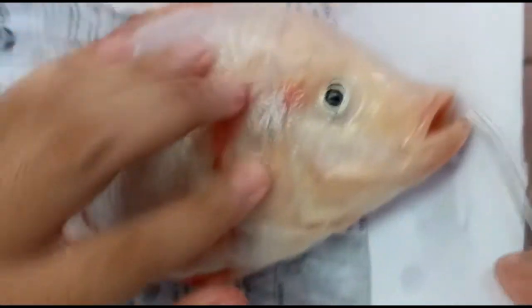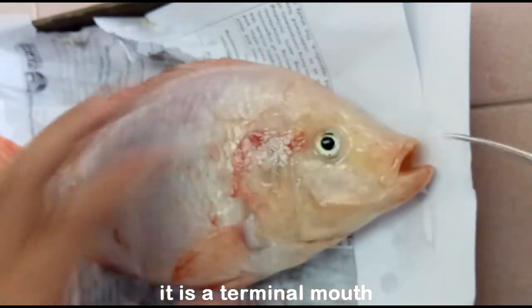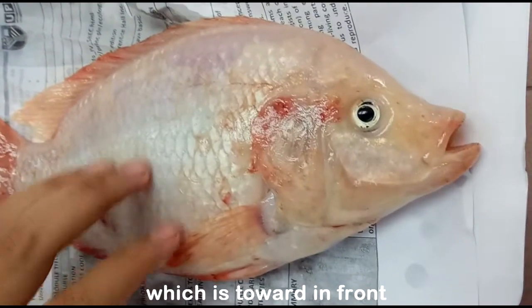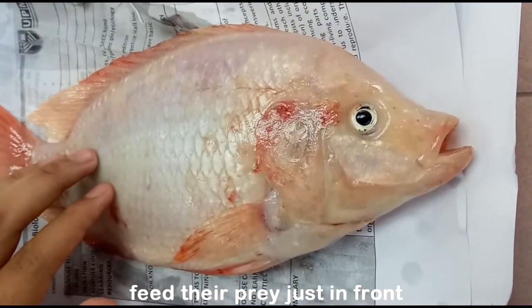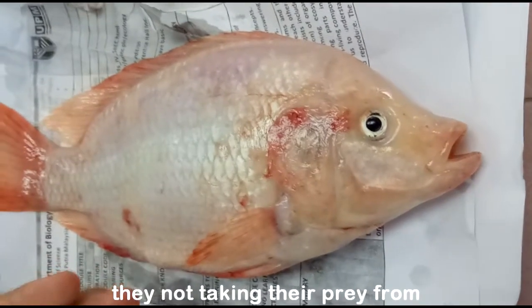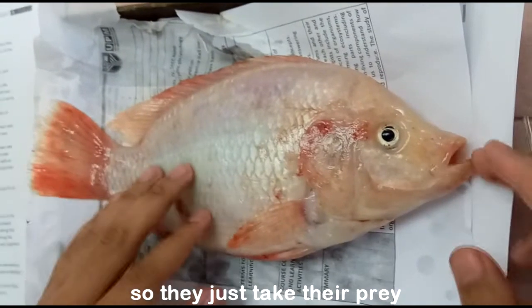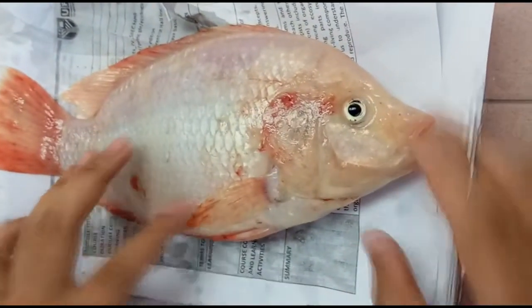Alright. So if you can see, the mouth is here. It is the terminal mouth, which is towards the front. It indicates that the tilapia feed on their prey just in front. They are not taking their prey from the surface or from the bottom. So they just take their prey in front of them, which is in front of the eye.